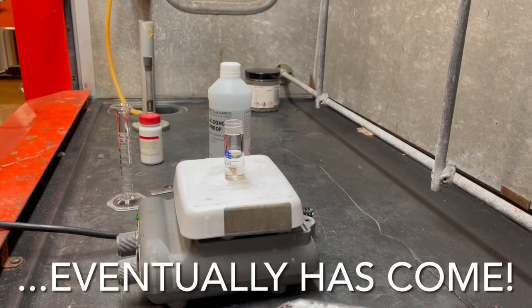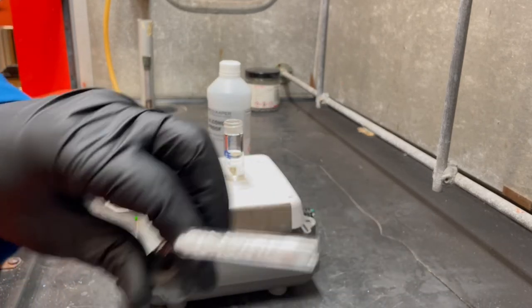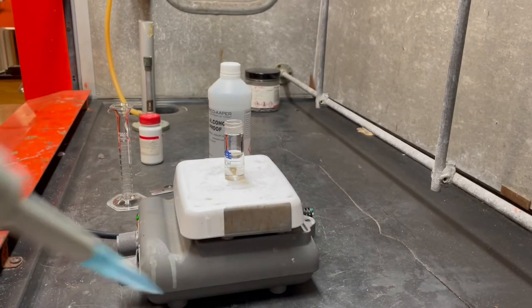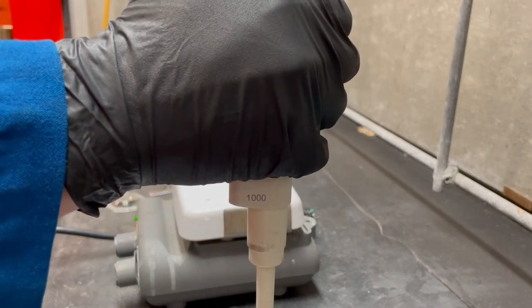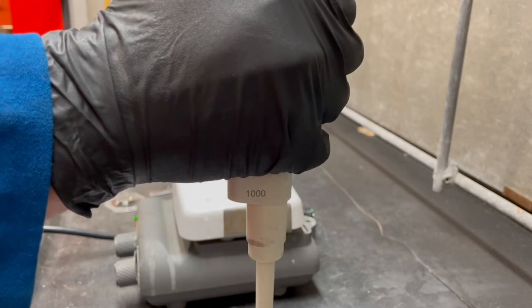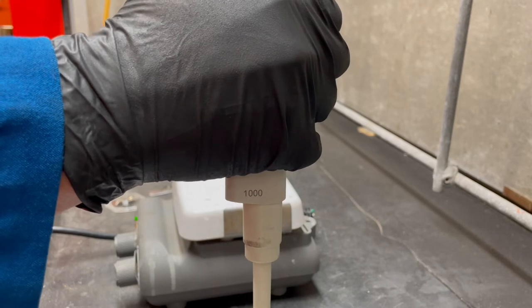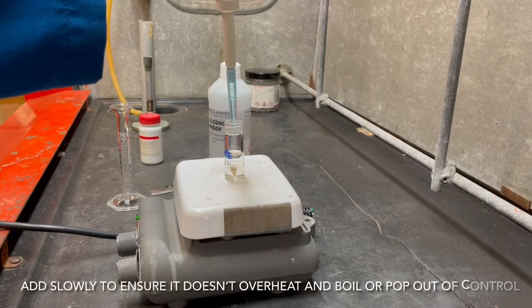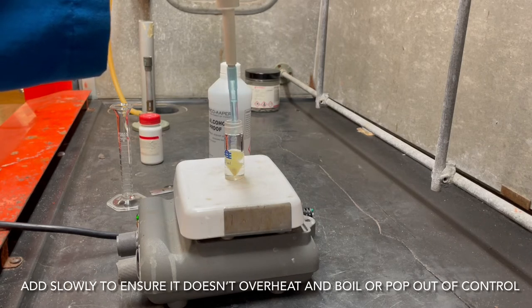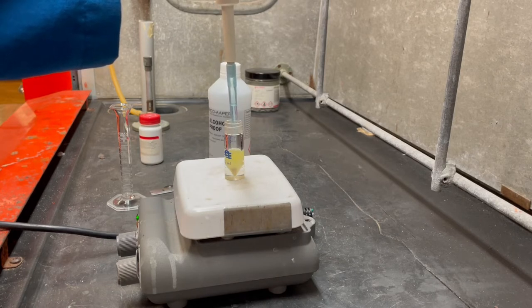All right, so I'm gonna go ahead and add 0.75 milliliters of my sodium ethoxide. And I'm gonna keep it stirring while I add it. Oop, I meant to add it slower than that. Slow and slow.